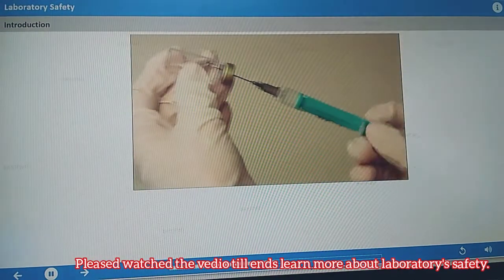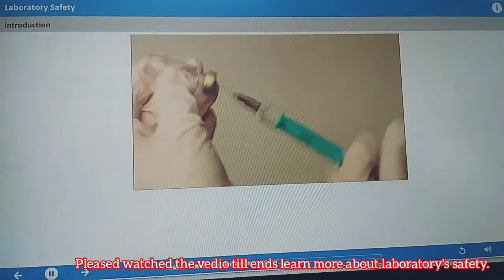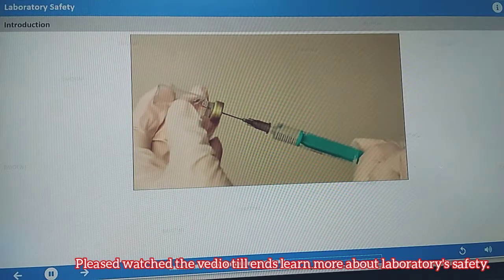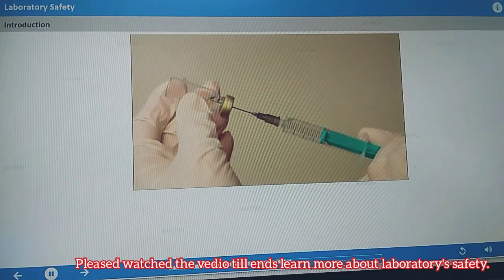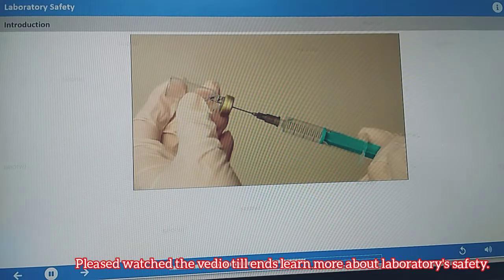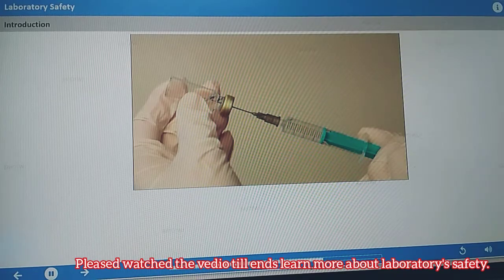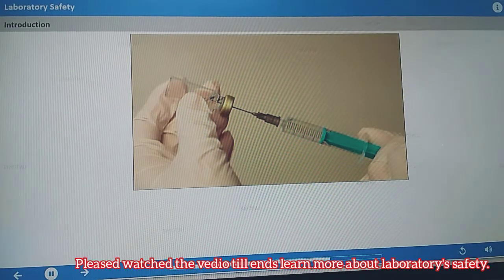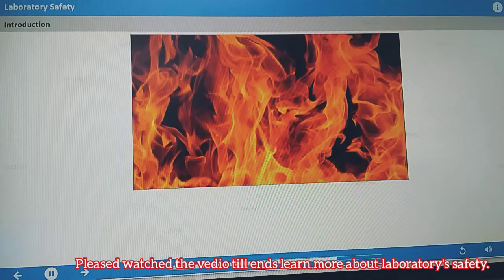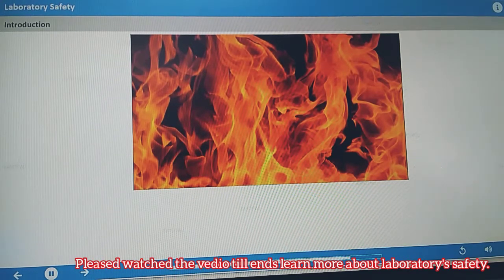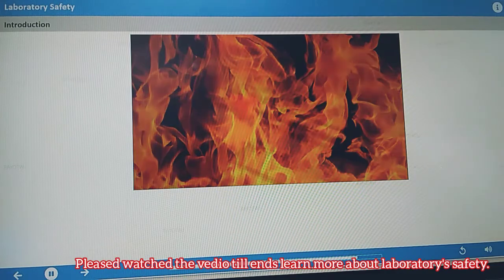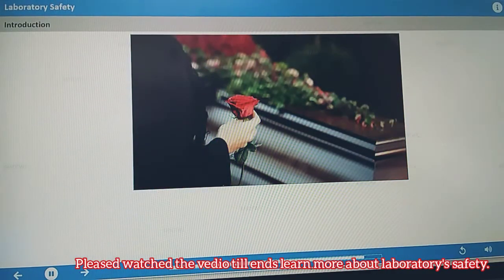A young research assistant at a West Coast lab was working with a pyrophoric chemical, t-butyl lithium, dissolved in a liquid. While using a syringe to withdraw a quantity of the reagent, she apparently pulled the plunger all the way out and spilled liquid onto her synthetic sweater and gloves. Introduced to air, the liquid ignited immediately. She sustained second and third degree burns over almost half of her body. A couple of weeks later, she died of those injuries.